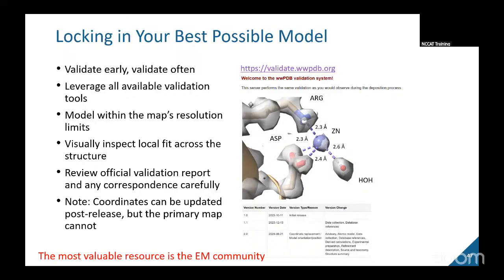But the first thing I would say is to validate early and validate often. Use every tool out there that you can find, including the validation server from the Worldwide PDB, and do it throughout your process. So don't wait until the very last minute when you think it's time to deposit.